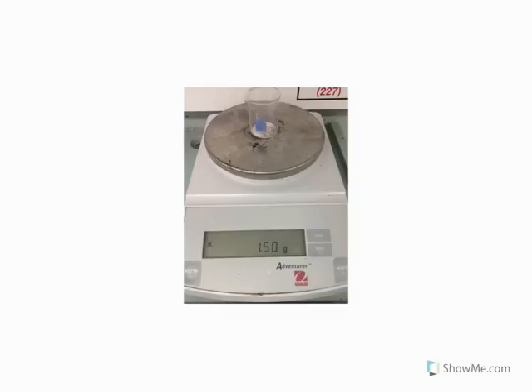Your teacher will then weigh out approximately 1.5 grams of silver nitrate. They'll tell you exactly how much is in the beaker. Make sure you record that amount in your data table. Carefully walk your beaker back to your lab bench and then add water to make a solution.